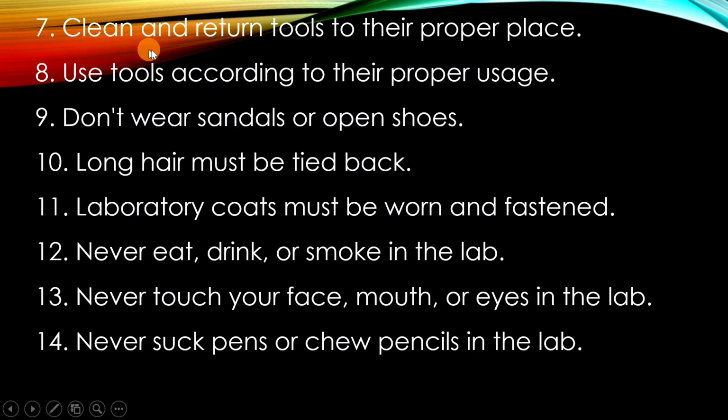Then you need to clean and return tools to their proper place. So after you use the beakers, you need to clean them and then return them to their proper place where they're supposed to be.